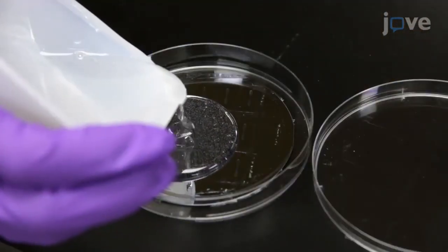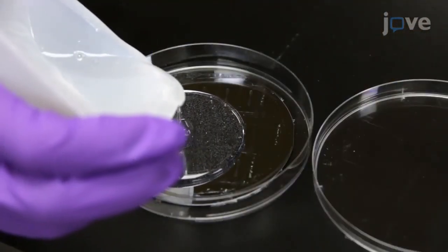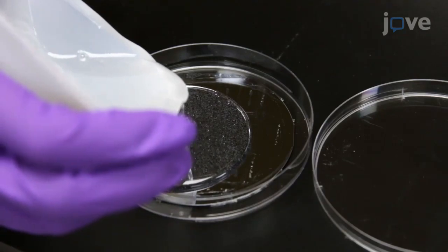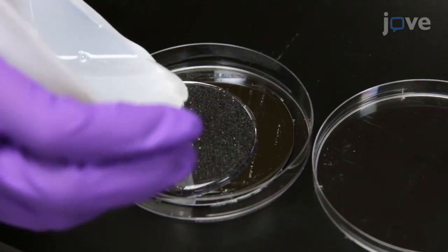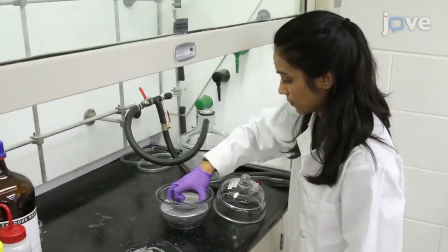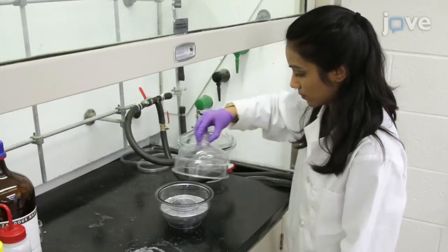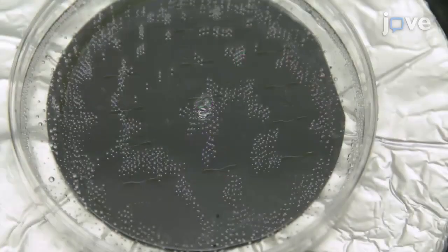Place the master silicon wafer in a plastic Petri dish and pour the PDMS solution over the wafer to create a 5mm layer. Cover the dish and leave it in a desiccator under vacuum for one hour to remove air bubbles.